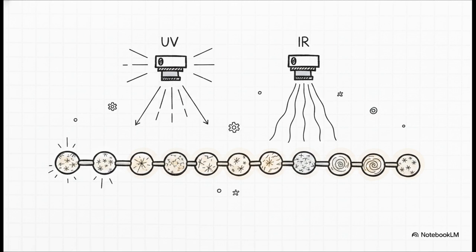While the differential refractometer is definitely the workhorse, it's not the only tool in the box. Analysts will often use alternative photometric detectors alongside it. These include detectors operating in the ultraviolet, or UV range, and the infrared, or IR range. Rather than just giving a general signal that a molecule has exited, these UV and IR detectors are used to measure specific properties of the macromolecular solutions. So they add this whole extra layer of specific chemical identification right on top of the physical size separation.